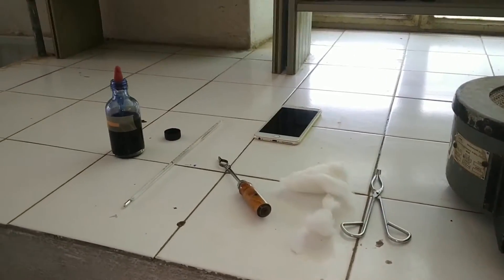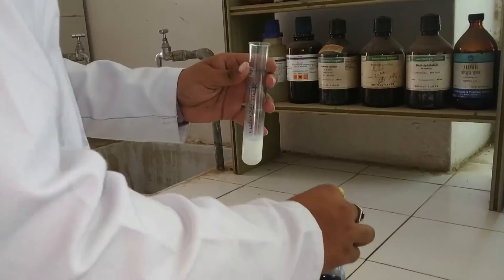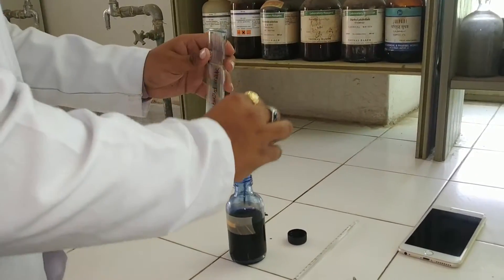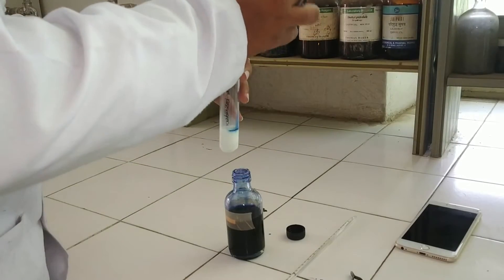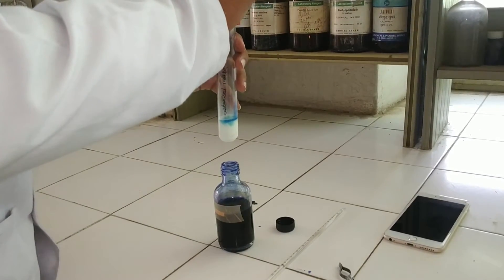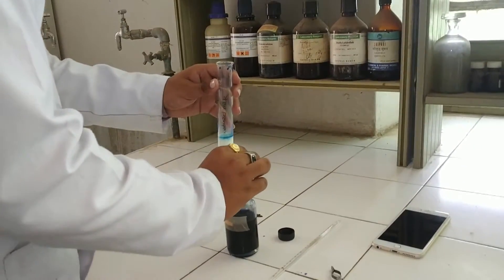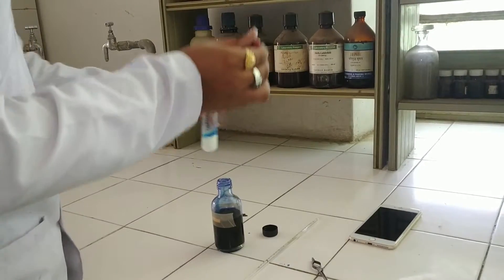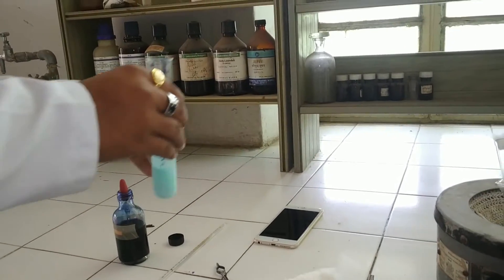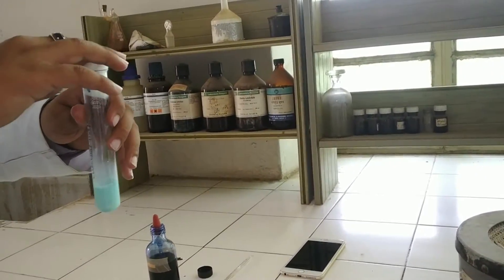Take the third sample, which is pasteurized milk. Add 2 to 3 drops of methylene blue. Slightly shake and mix the methylene blue. Then add a cotton stopper on the lid.